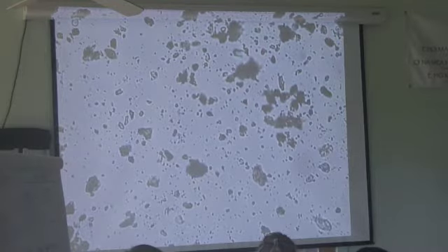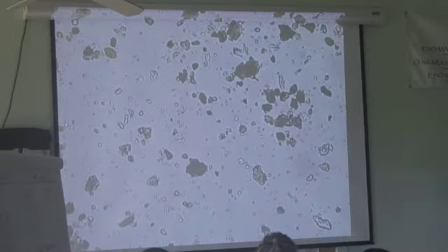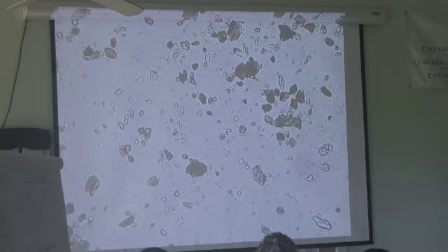But you just can't wait around for them. You don't want to wait too long on any field. See, there he is back, and that's got to be a ciliate. Every time you move the stage, is that a new field? Yep. So typically when we're doing quantification, we're going to start in the upper right-hand corner. So we just go somewhere up there. Try to choose a field of view. You can see, because I moved my slide sideways, I moved my cover, so this is not quite a kosher sample.